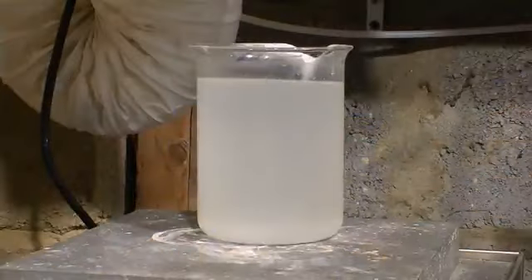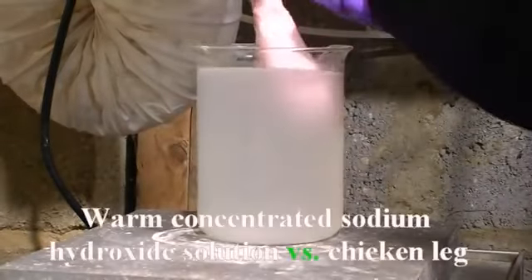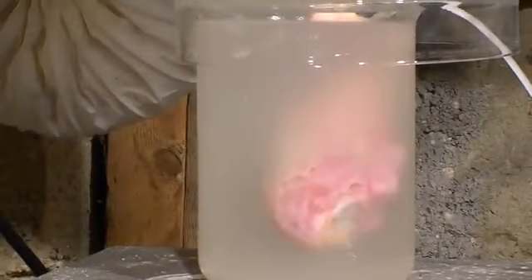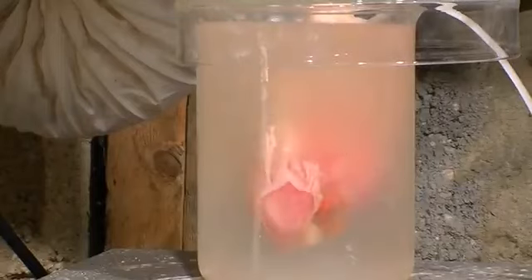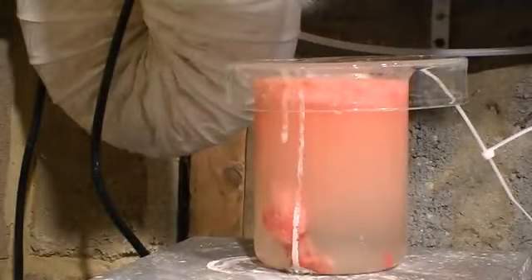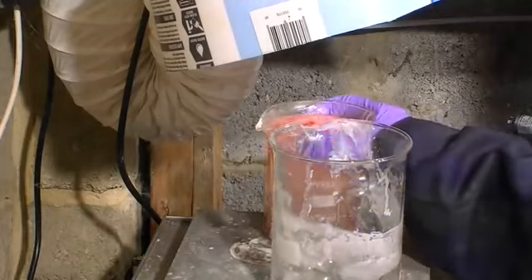In the penultimate demonstration, we're going to show the rather gruesome reaction between concentrated sodium hydroxide solution and a raw chicken drumstick. This reaction is shown by immersing a chicken drumstick in a beaker of concentrated sodium hydroxide solution at around 60 degrees Celsius.